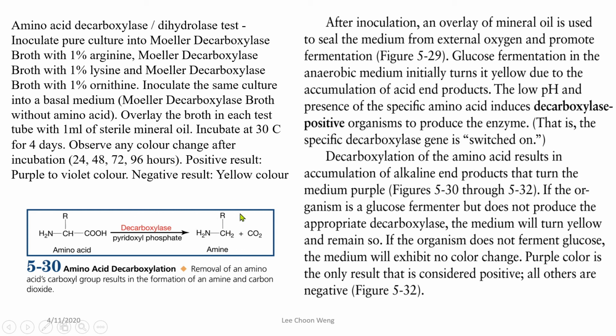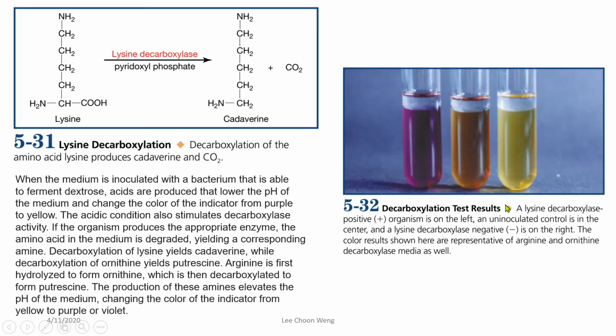Because this is an alkaline product, the pH indicators will start turning purple. So purple is considered positive.